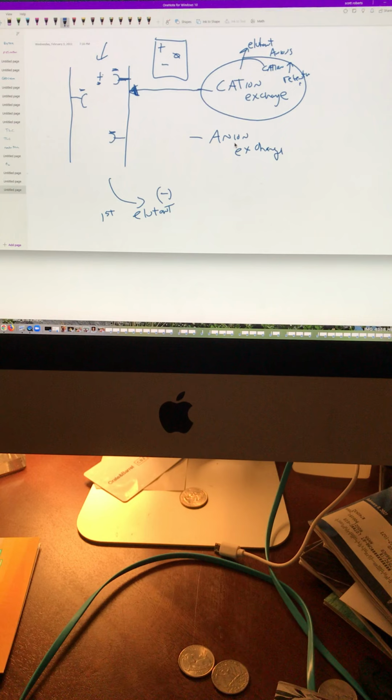Now, in anion exchange, and they ask this, right? In anion exchange, they don't all elute until you use a salt and break them free. That's another interesting thing: in cation exchange, are you trying to isolate anions or cations? And the answer is it could be either. So in cation exchange, you might catch all the cations and then use a salt and break them apart and catch them later and get rid of everything else. You see what I'm saying?